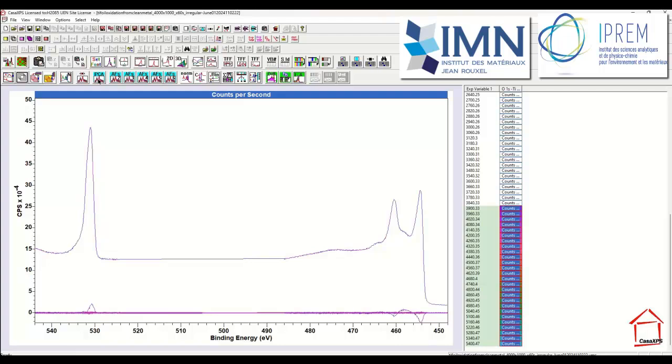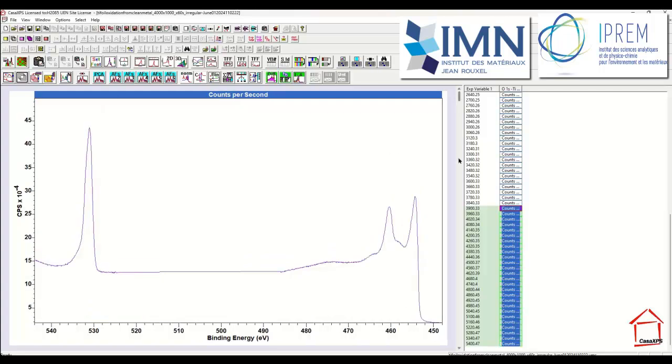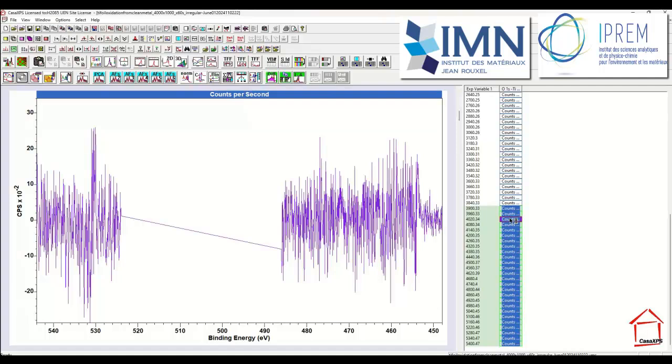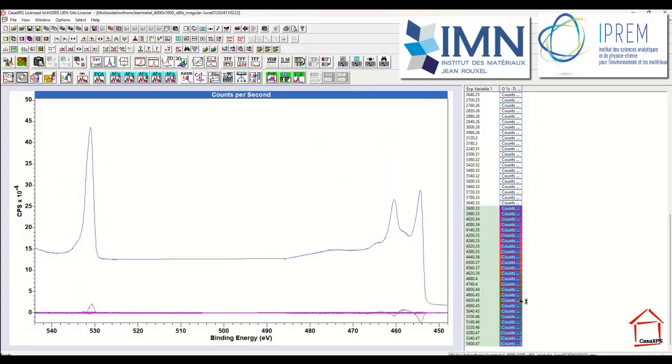So when I perform a PCA on these data and look at the abstract factors again, that third abstract factor now looks like noise. So that suggests that I can reproduce all of these data in this part of the experiment using two abstract factors.